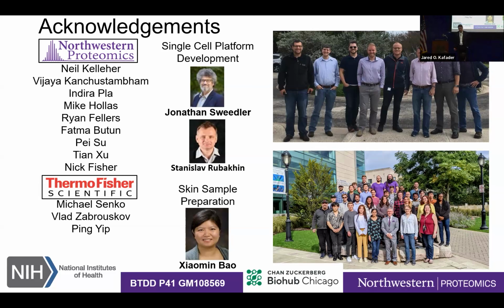So in your 500 to 600 proteoforms that you see in nuclei, how large can those proteoforms be? Are you limited in the molecular mass of those proteoforms? And if you funnel them down to proteins from proteoforms, then what is the representation of the proteome? 100 proteins, 50 proteins? Please give us more detail.